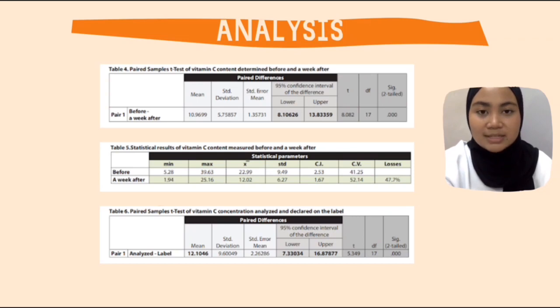Table 5 illustrates the statistical results of the vitamin C content of commercial fruit juice samples before and after opening a package. A week afterward, the vitamin C concentration was found to be in the range of 1.94 mg per 100 ml to 25.16 mg per 100 ml. The total amount of vitamin C losses ranged from 14.2% to 76% when commercial fruit juices were stored in open conditions and at room temperature for 7 days. The calculated average loss was 47.7%.